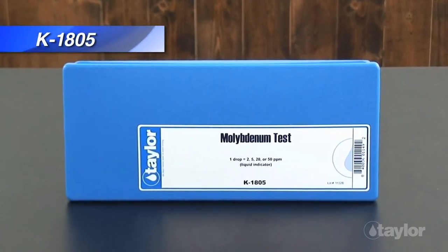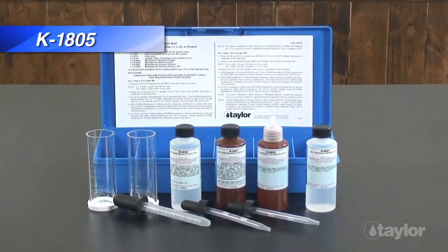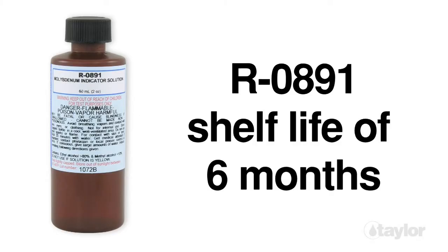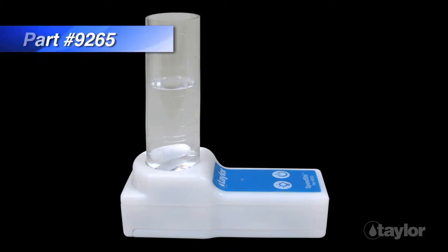Taylor's optional kit for testing molybdenum, K1805, contains a prepared liquid indicator, R-0891, that has a shelf life of 6 months. For this demonstration, we are using Taylor's SpeedStir, which is sold separately, but you can also manually swirl the sample.